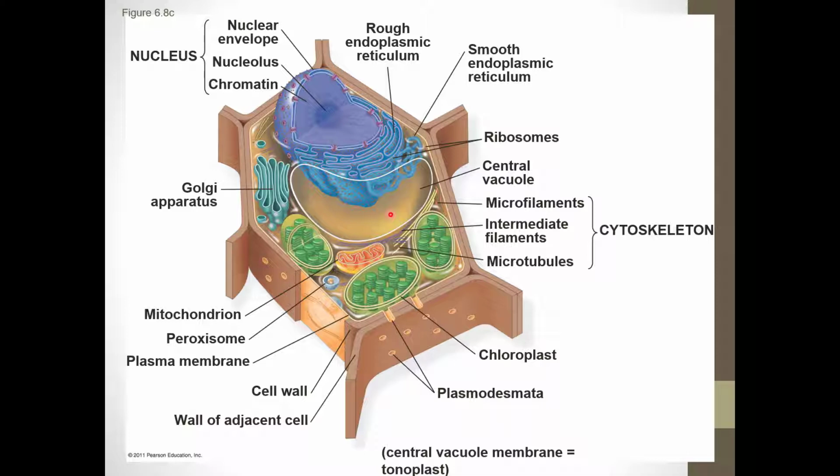In the case of beet cells, they store beta-cyanin in here, that red stuff that leaks out. So if we damage this plasma membrane with, let's say, ethyl alcohol, maybe we dissolve the phospholipid layer with alcohol, or maybe the alcohol denatures proteins in that layer, then the alcohol could get in here and denature the proteins in the tonoplast membrane, or dissolve the phospholipids here, allowing beta-cyanin to leak out into our test tube, and then we could see that damage or measure that damage.